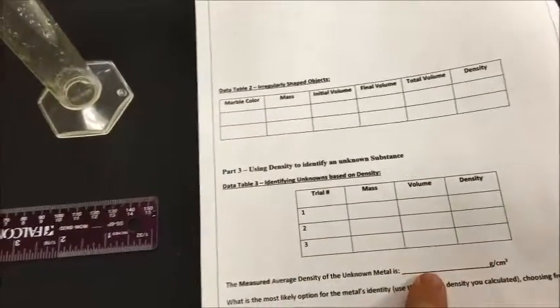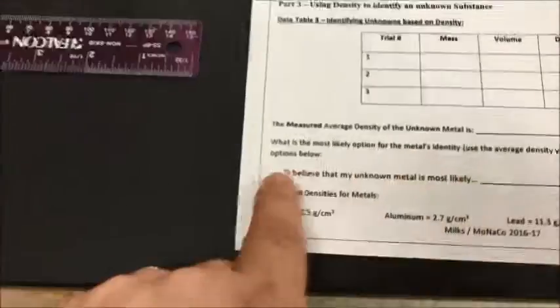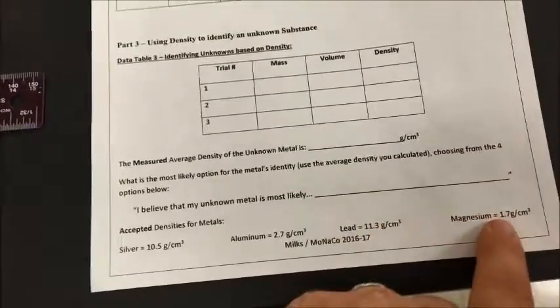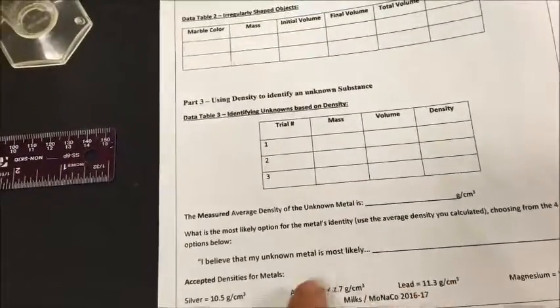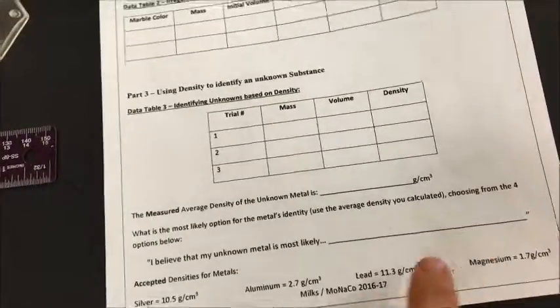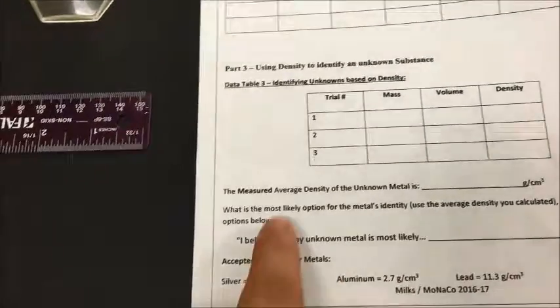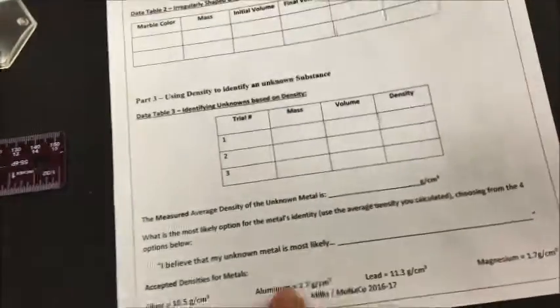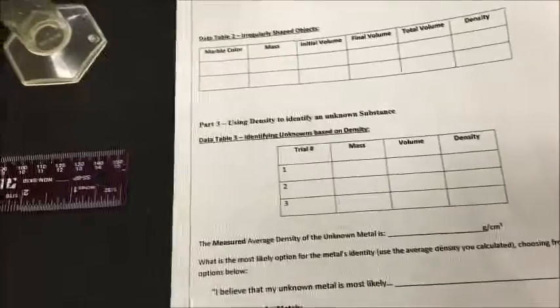So if you average 3 results of density, you'll get a really good number to use, which will compare to these values. It might not be exactly one of these, but it will be closest to one of them, and you can make an educated estimation that you believe your unknown metal is most likely 1, 2, 3, or 4.